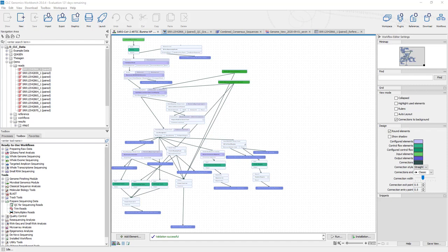And before we get into this analysis, right now up on the screen I have the full workflow, which I have to admit, when I started using CLC a while ago, I found these workflows to be quite intimidating. It looks like there's a lot going on, a lot of directions of data. So what I'd like to do in this first video is just talk about where we want to get to and put this workflow aside.